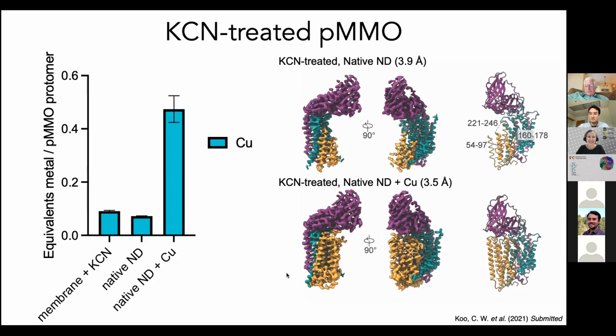One more: does the community know of any way to identify specific metal ions in density maps? Oh, that's an interesting one. We just had a validation challenge with the PDB for trying to identify waters versus metal ions.